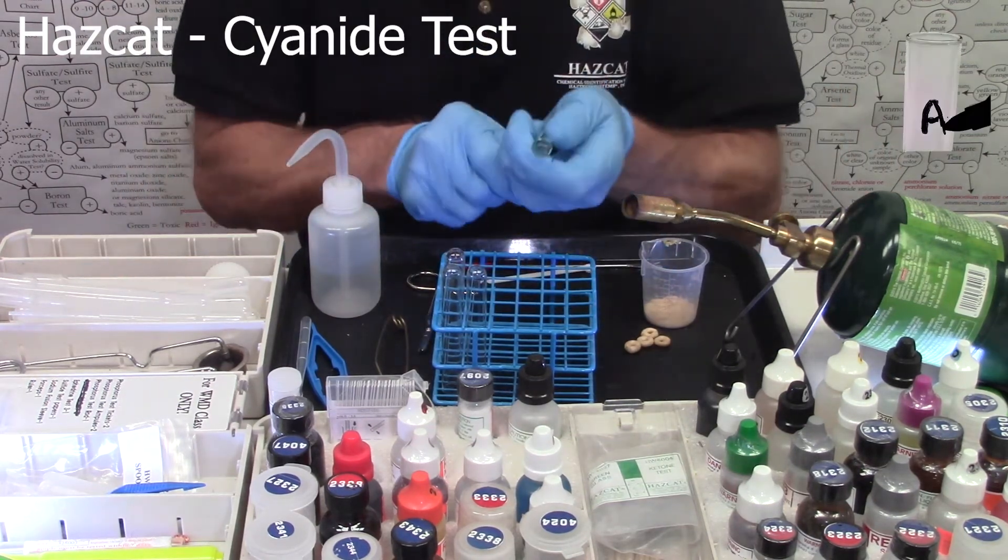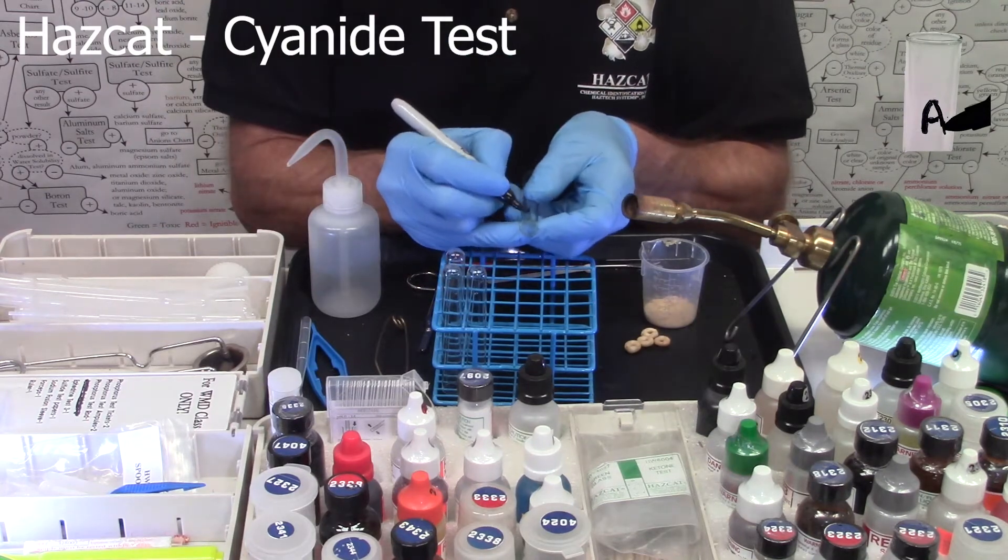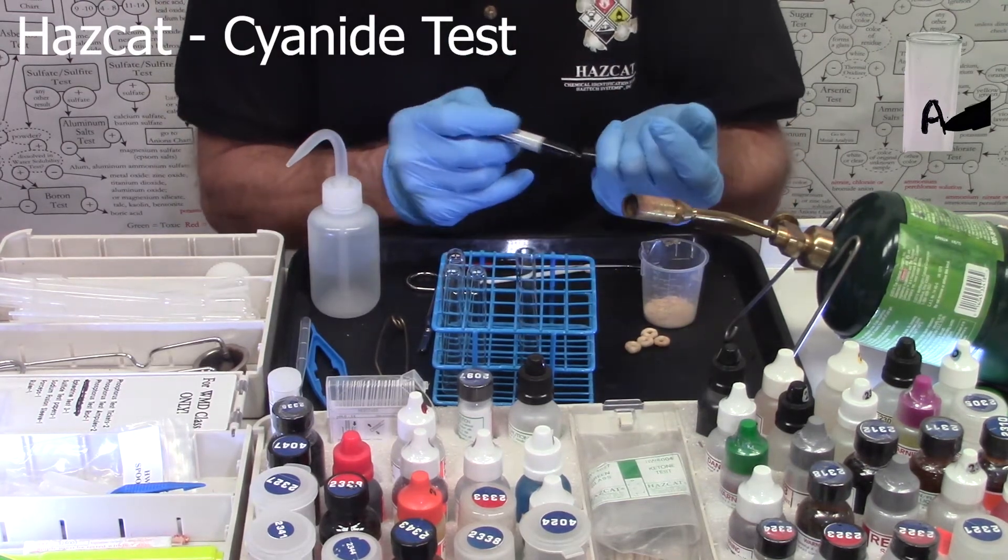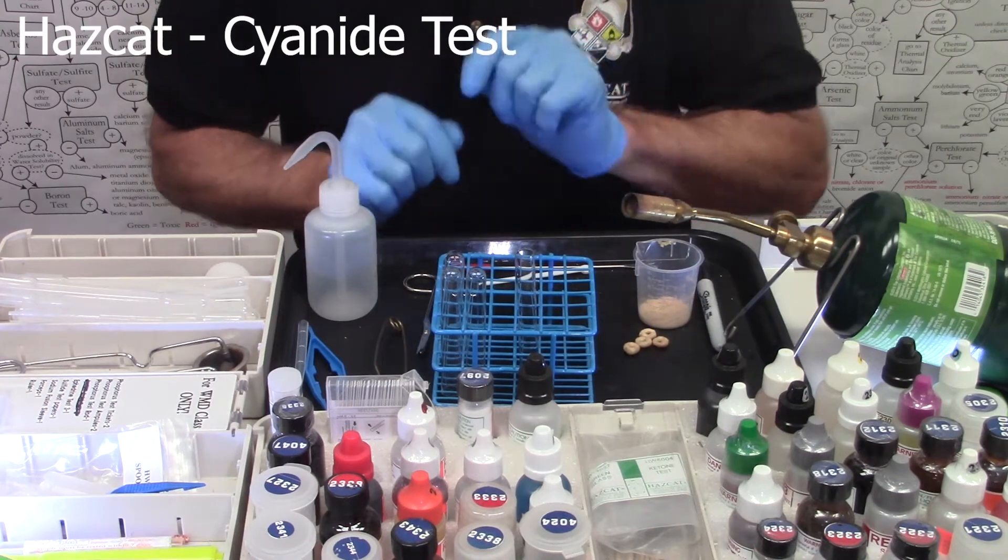We start out by taking a test tube and marking it with an A. We're going to add four things to that.